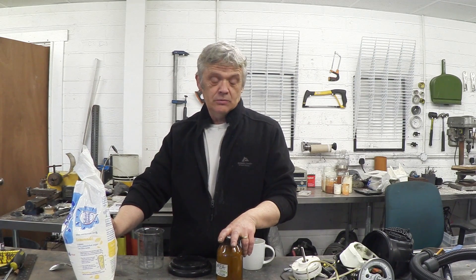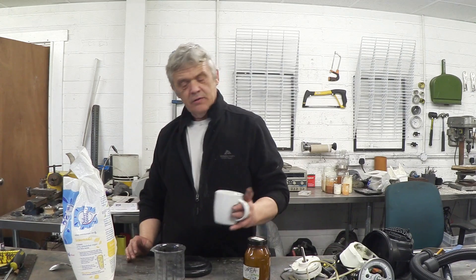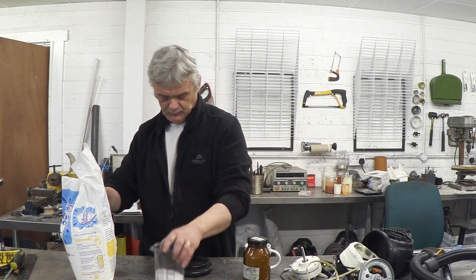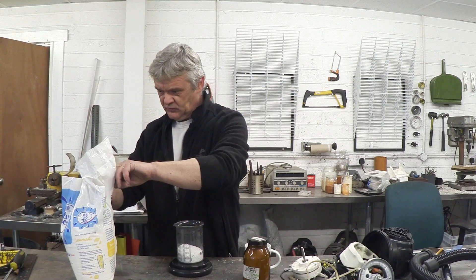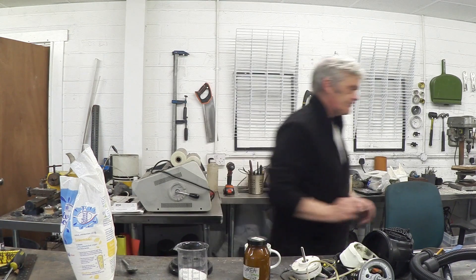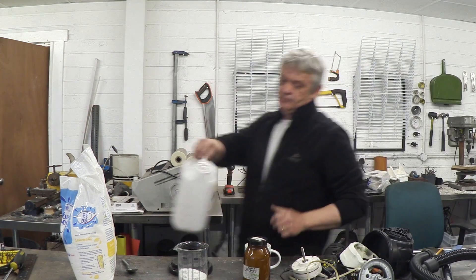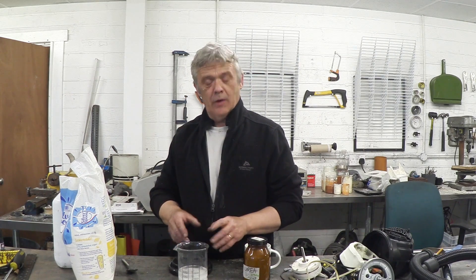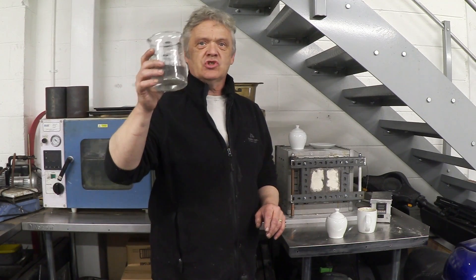All you need is 150 grams of urea and 15 grams of table sugar. We need to get those to mix, so we add sufficient water to get everything dissolved, then put it on a heater stirrer and turn it into a syrup. After about half an hour of stirring it's all dissolved — it's warm at around 80 degrees C, supersaturated but nicely and intimately mixed.